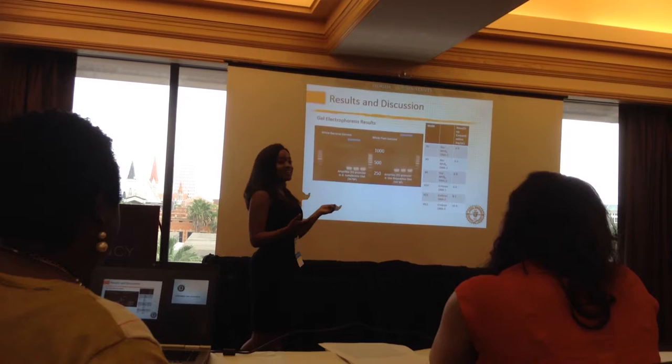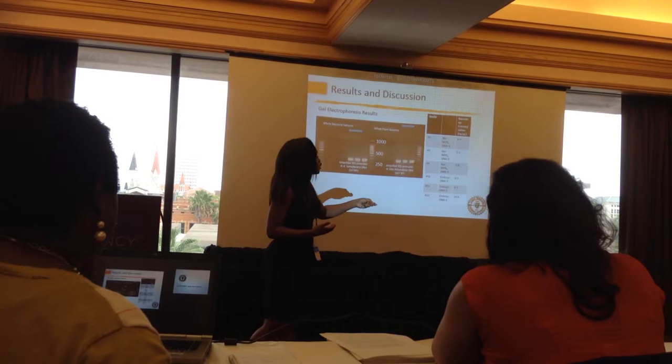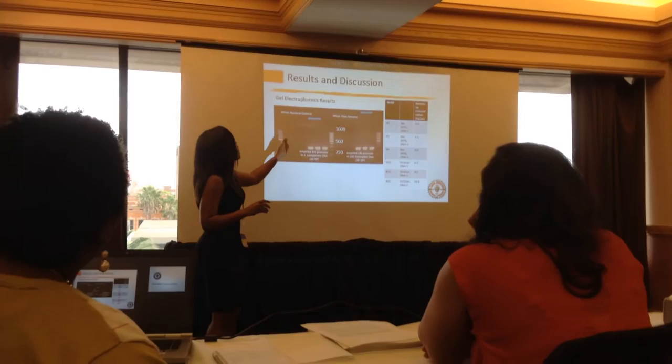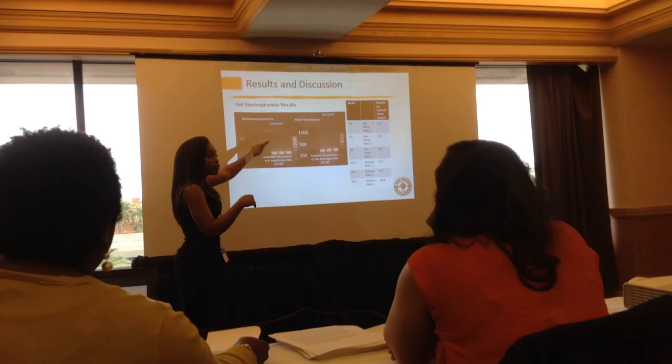This table right here shows the nanodrop concentrations. That's at like nanograms per microliter. That's very small. And so you see in wells 2, 3, and 4, that's the whole bacterial genome. You can't really see it, but if you were able to see the picture, you'd know that there was a small fluorescence there. Not as bright as this one, because it's not as high a concentration.